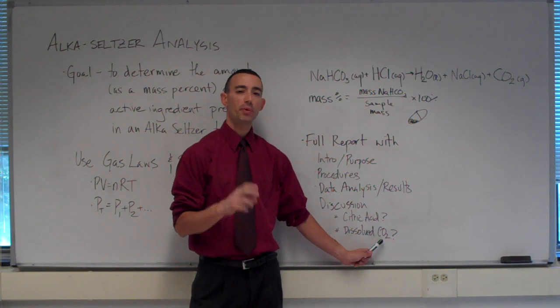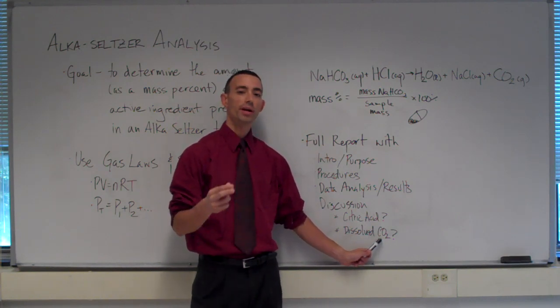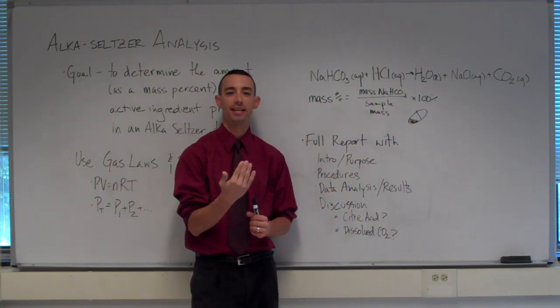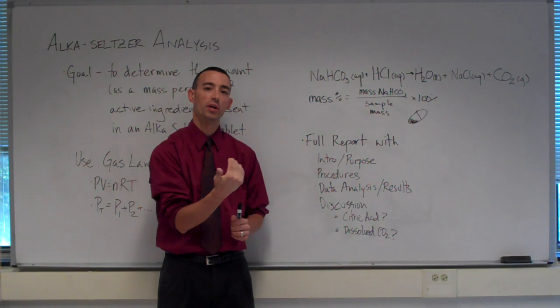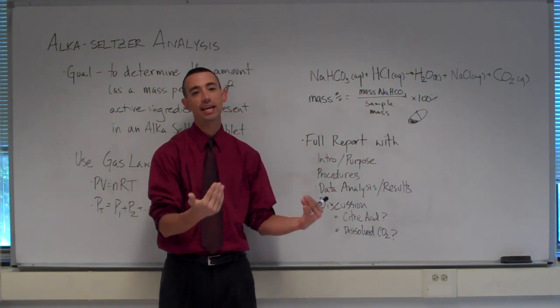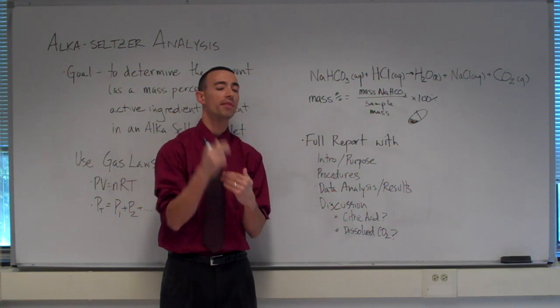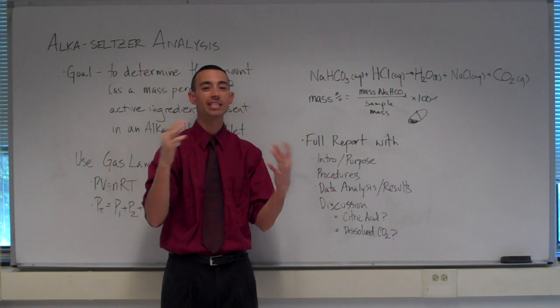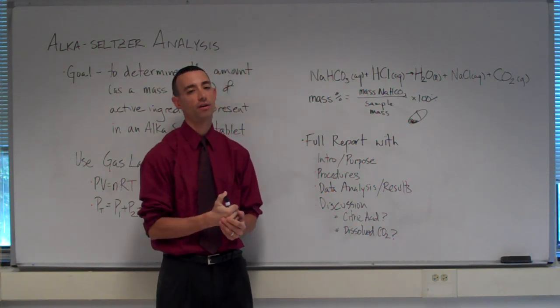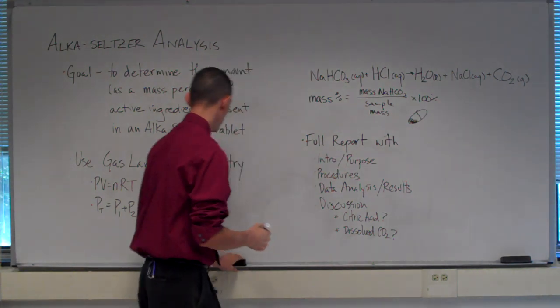If we did not pre-saturate our water through which our gas is traveling, as it traveled up into our burette that I showed you earlier, some of it would actually get dissolved into the water. That would decrease the volume that we collect in our burette because some of it has disappeared into the water itself. So that's an important step to take into account.